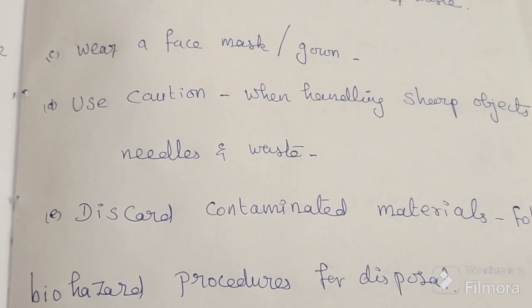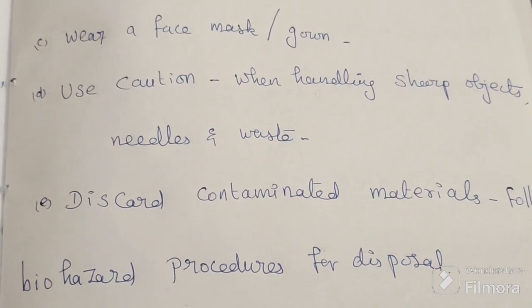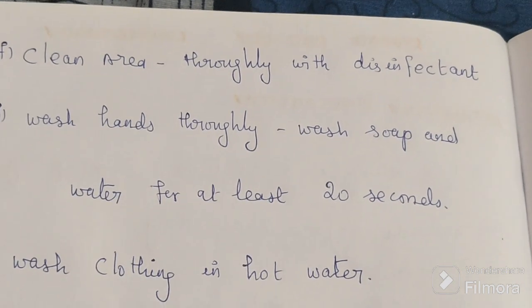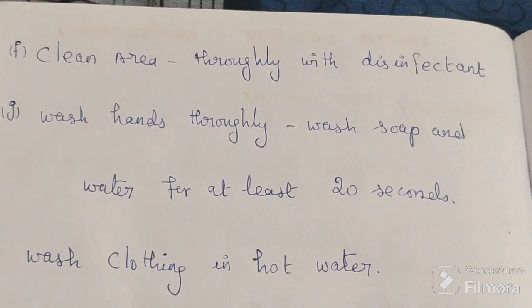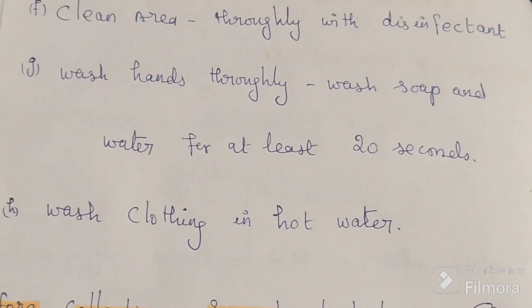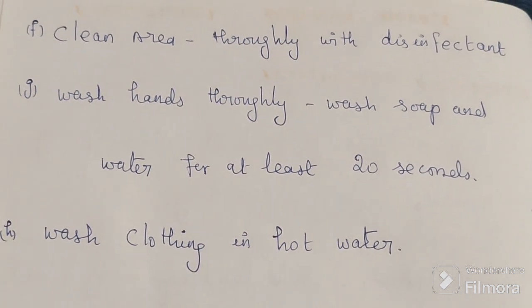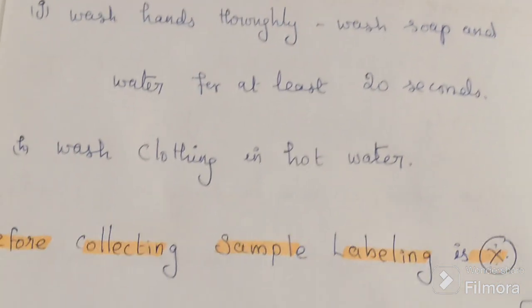Then discard contaminated material. Follow biohazard procedure for disposal. Clean the area thoroughly with disinfectant. Then wash our hands thoroughly using soap and water for at least 20 seconds. Then wash our clothes using hot water, not normal or cool water. Wash clothes using hot water.